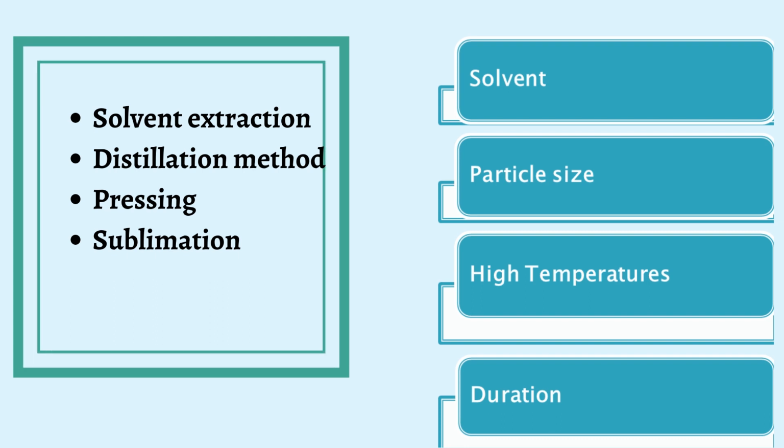The next parameter is temperature. High temperature always increases the solubility and diffusion property of the solvent. Temperature that is too high, however, may cause solvents to be lost, leading to the extraction of undesirable impurities and the decomposition of thermolabile components.